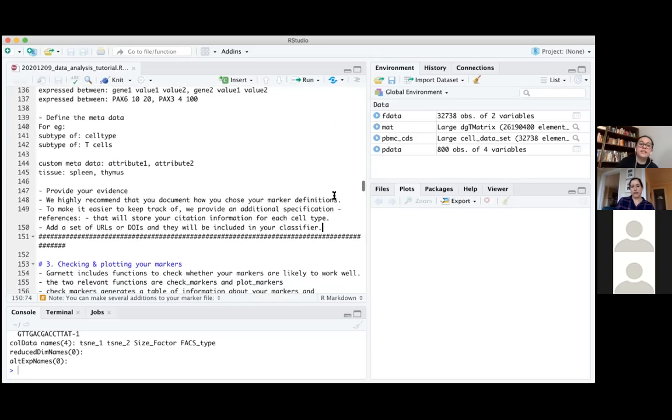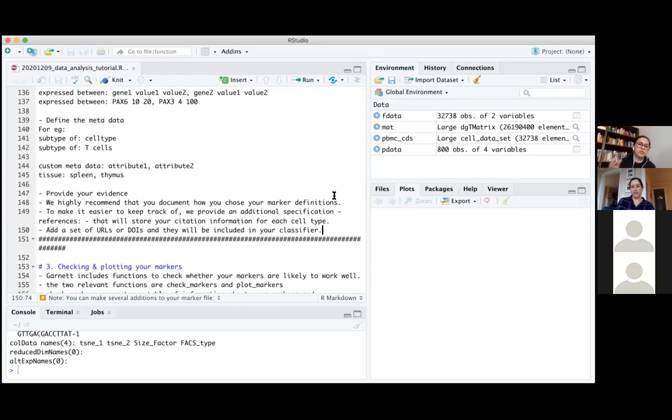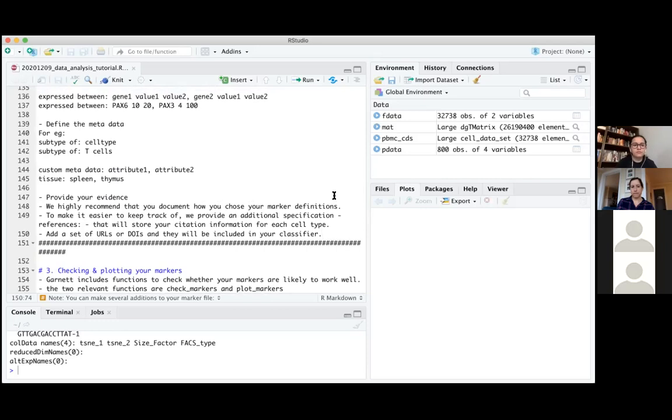It's going to read in the expression values from the CDS, but those could be gene expression values from your bulk RNA-seq data as well. I just want to make sure that if I'm putting in values, it's correlating with the correct information from my CDS. Right. So it's just expression values.